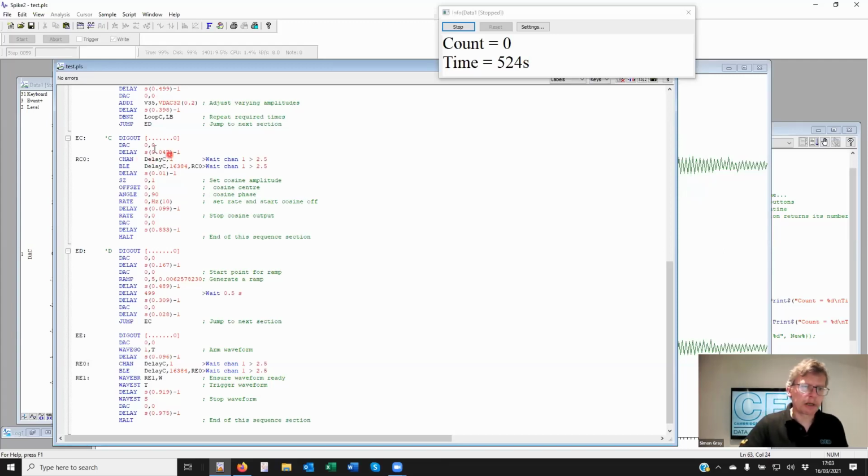Oh yes, right. Something like this. We've made it easier by putting in milliseconds or seconds or even microseconds and then a value. That's the delay time, and so the sequencer calculates how many ticks it takes for that time to elapse. So usually you would normally have put in something like delay 1000, meaning 1000 milliseconds, because that's the resolution that we've set. We then say minus 1 from that, as you see here, because that's the delay command itself taking up one of those clock ticks. Okay, and so that's a little bit more detail on the text sequencer side there.